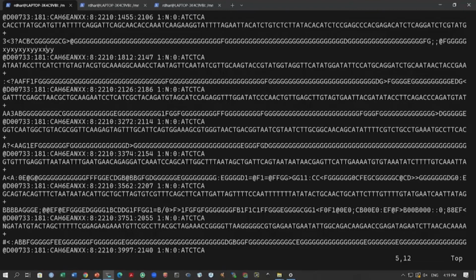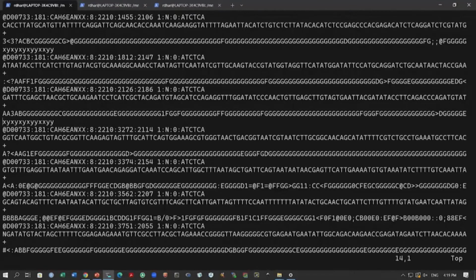So, if we press Y twice, it will copy that line, and if you want to paste that line somewhere in the file again, we go to that line where we want to paste it, and we press P and that line will be pasted. This is very convenient, we can copy this line very easily with these commands. So, the command is YYP. This is a kind of copy paste command, equivalent to copy paste in Windows.